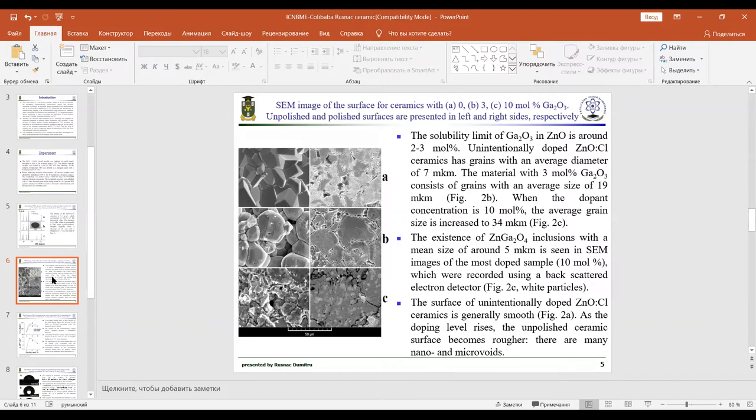The surface of unintentionally doped zinc oxide chloride ceramics is generally smooth. As the doping level raises, the unpolished ceramic surface becomes rougher. There are many nano and micro voids.